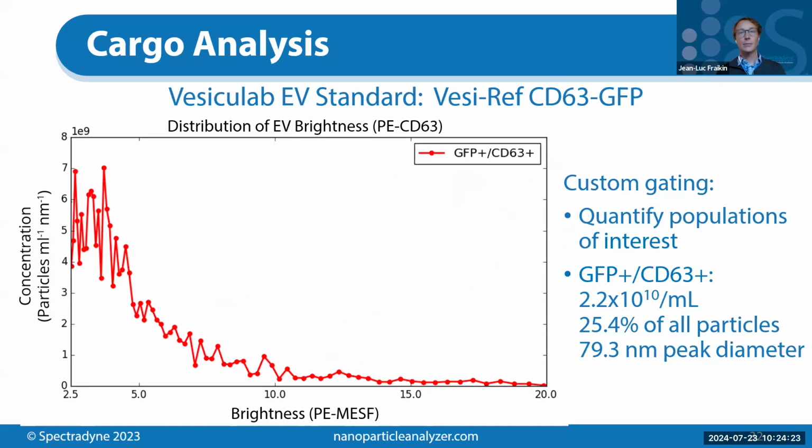That's a really, really powerful unit because you can take that unit from one instrument to another. It's translatable, right? And you can compare results. Compare that to your normal flow cytometry data, which is just arbitrary units of scatter or detector voltage. This is a much more powerful unit.